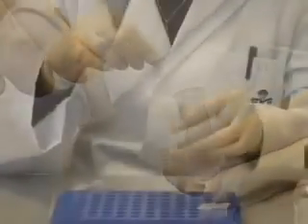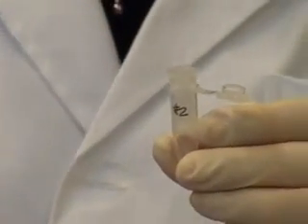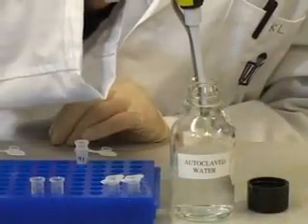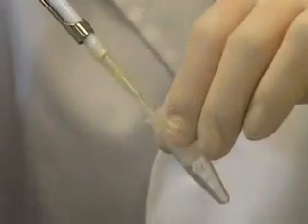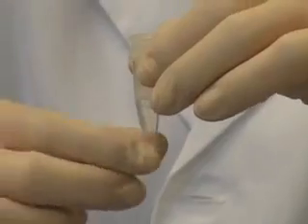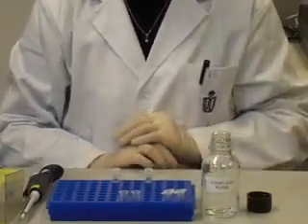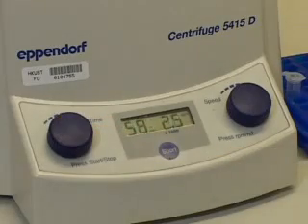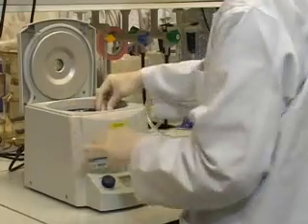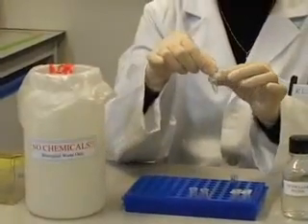Transfer the spin column to a clean 1.5 mL microcentrifuge tube. Add 50 µL of nuclease-free autoclave deionized and distilled water to the spin column. Stand for 2 minutes, then centrifuge at maximum speed for 1 minute at room temperature. Collect the plasmid DNA eluted from the column.